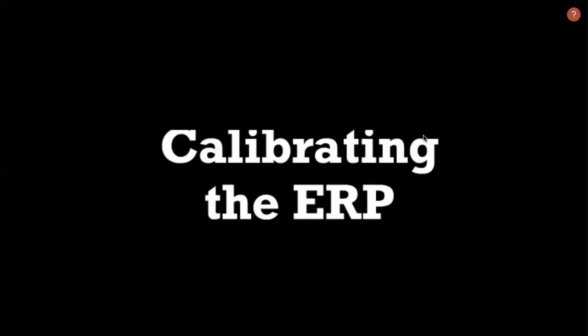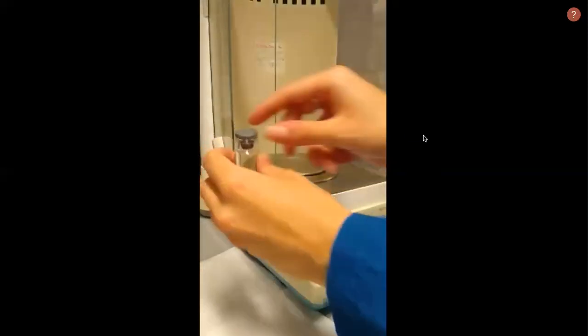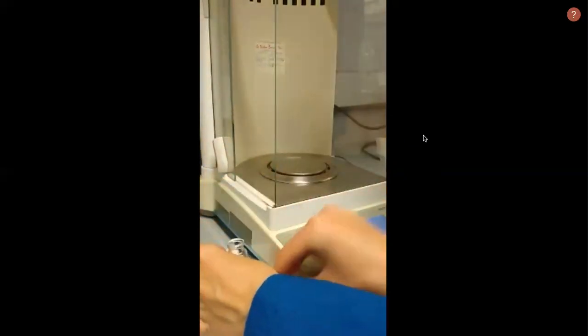Lastly, we need to calibrate the dispense from the Eppendorf repeating pipette. Using an analytical balance, we place an empty capped bottle and tare it. We need to use a capped bottle to avoid any spills in the expensive analytical balance. We remove the bottle and add the dispense from the Eppendorf repeating pipette.